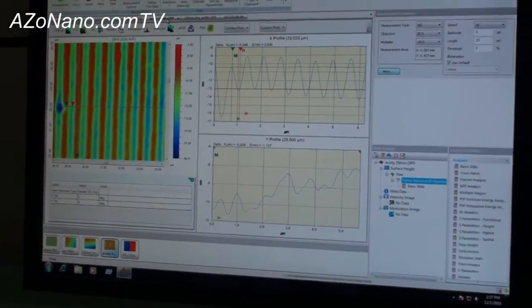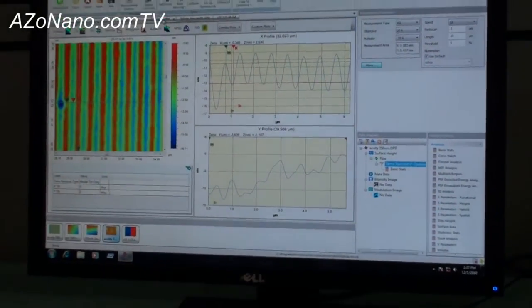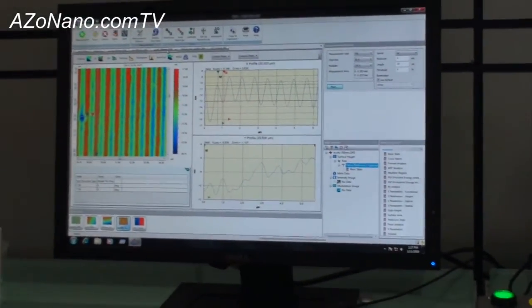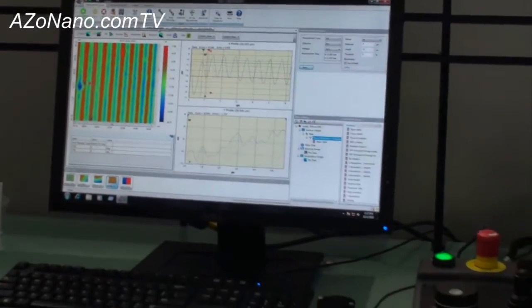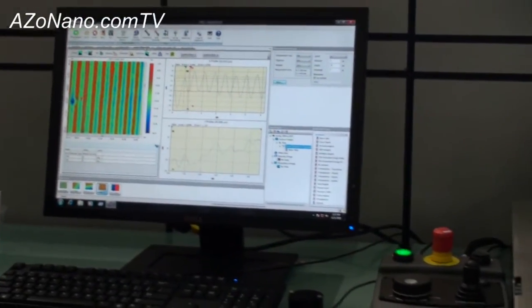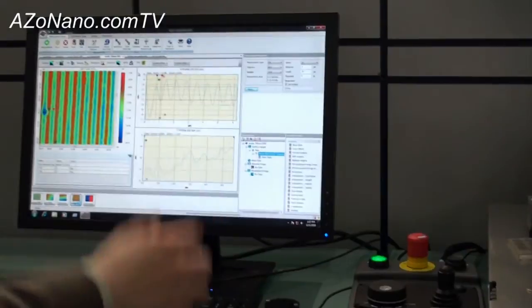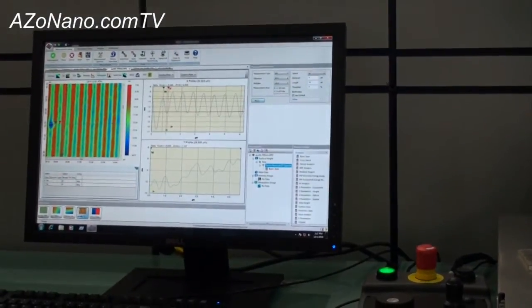Chris, how does it go with square grooves as opposed to rounder grooves? Is that any issue to the system? Nope. So one of the things actually, good thing you brought that up.